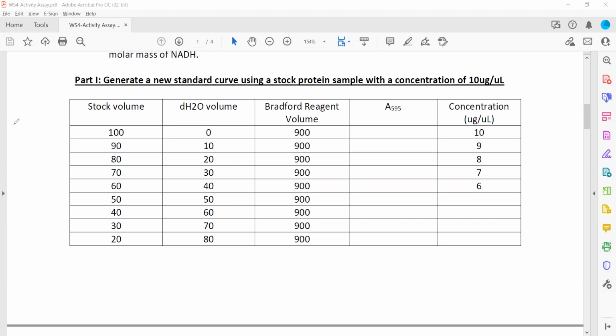You're going to be using a biorad spectrophotometer. I want y'all to be comfortable using one or the other because, well, 1, the spectrophotometer that we used last week is only a visible light spectrophotometer. Whereas this biorad spectrophotometer that we're going to be using will go into the UV range or UV light range. So make sure that you're comfortable using this. And I'm going to be posting another video showing you the sequence of buttons that we're going to push for this and everything like that.